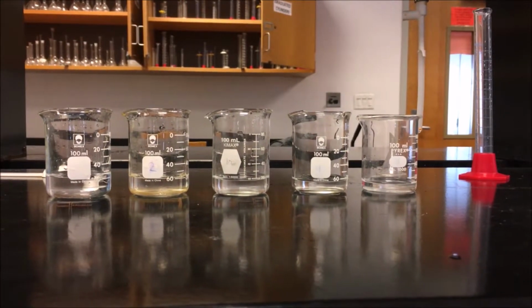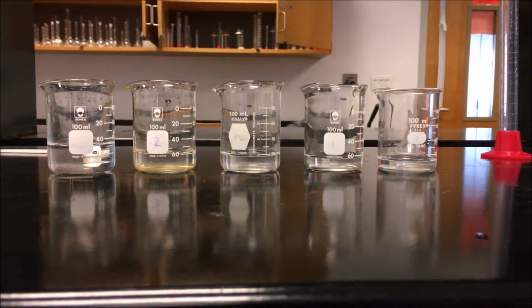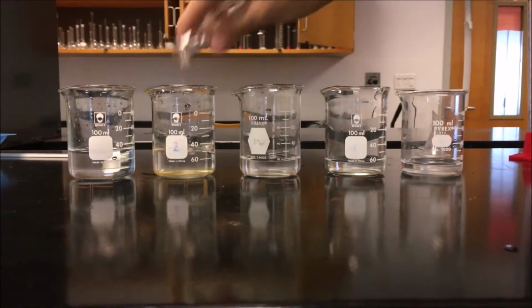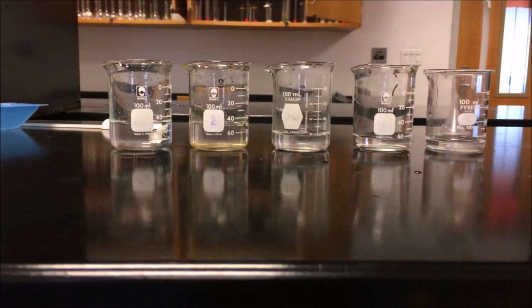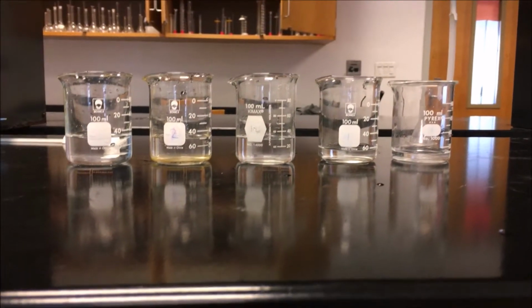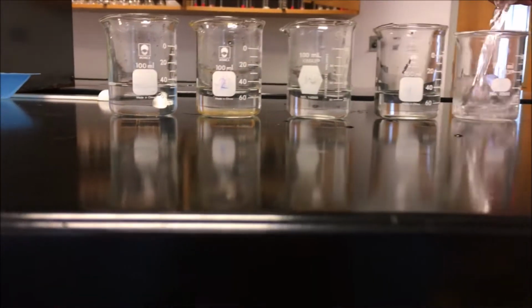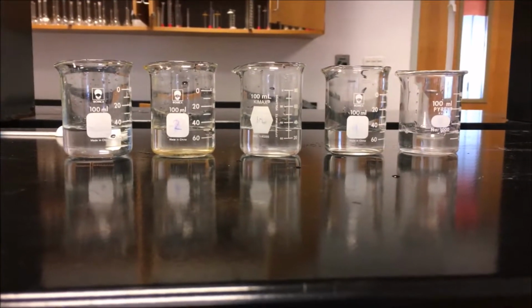For the third, add 8 milliliters. Add 10 milliliters for the fourth. 12 milliliters for the fifth. 14 milliliters for the sixth. And 16 milliliters for the last beaker.